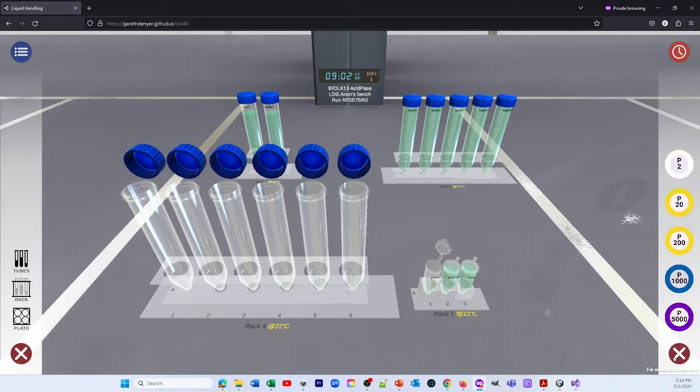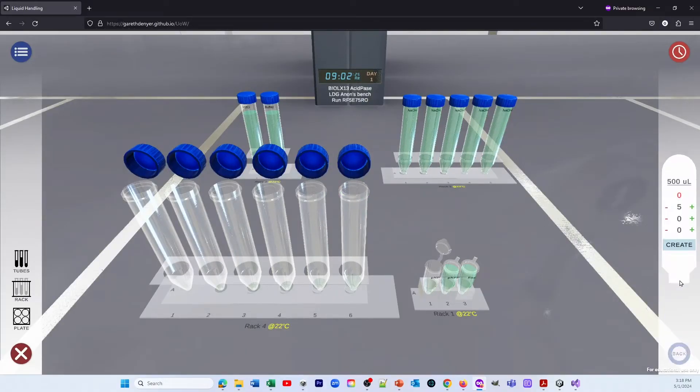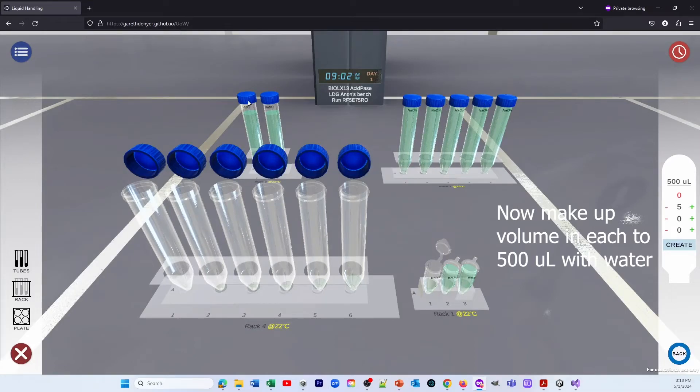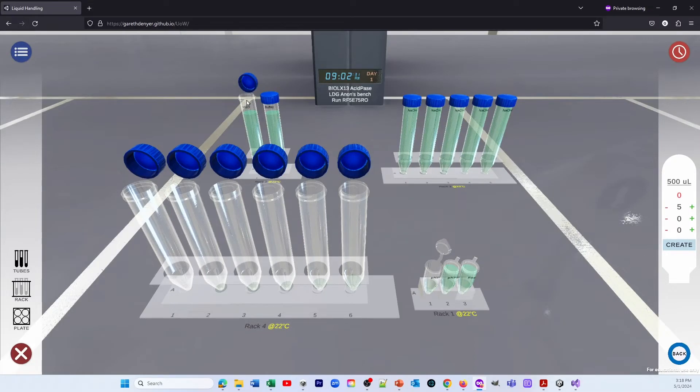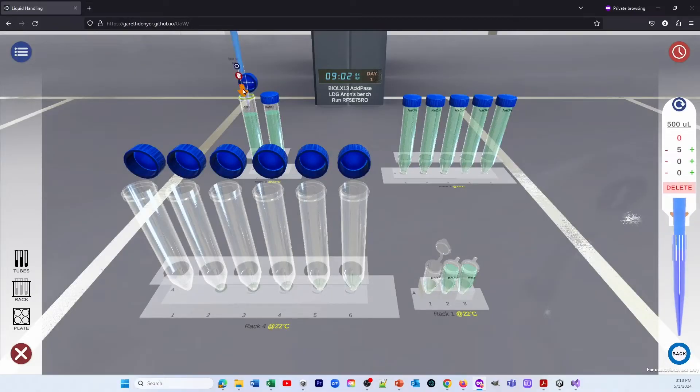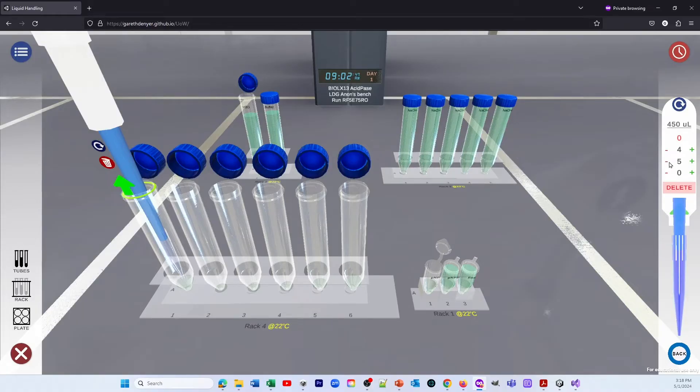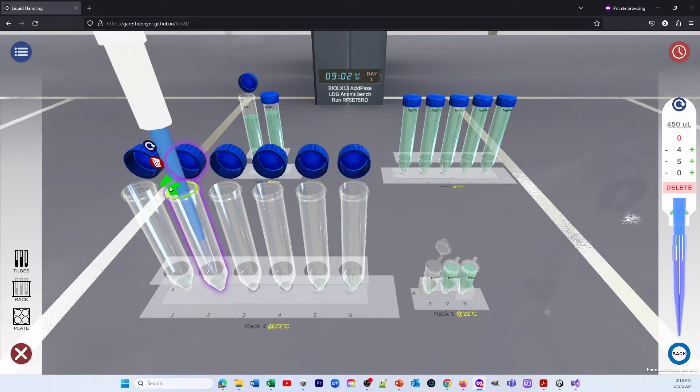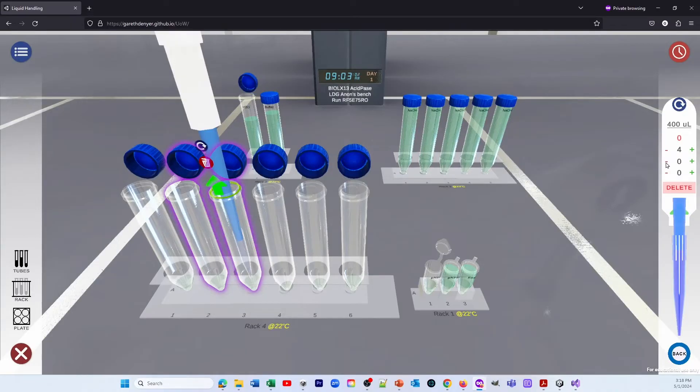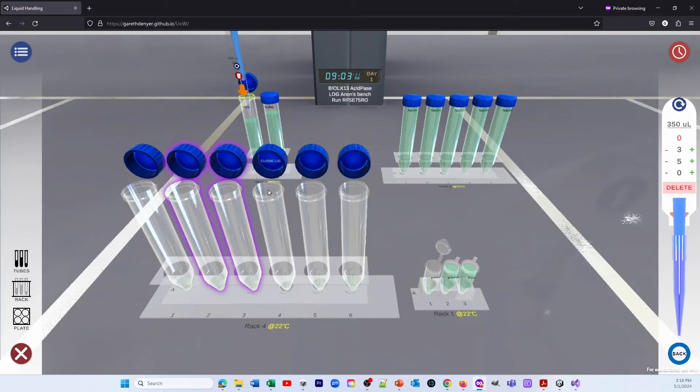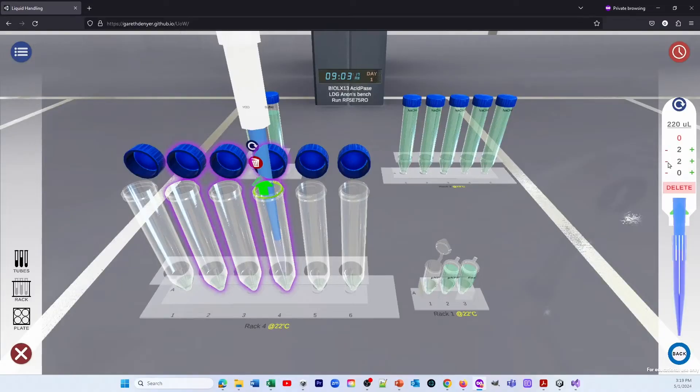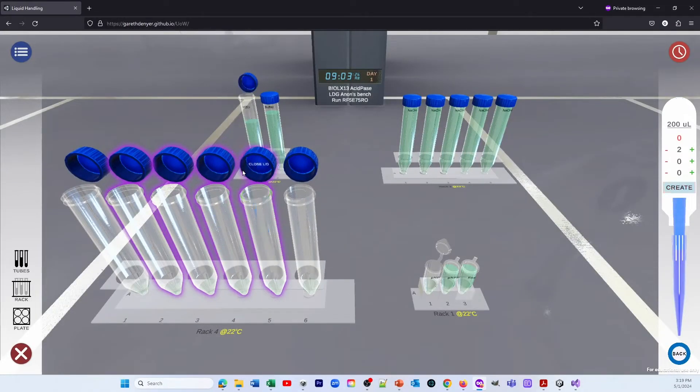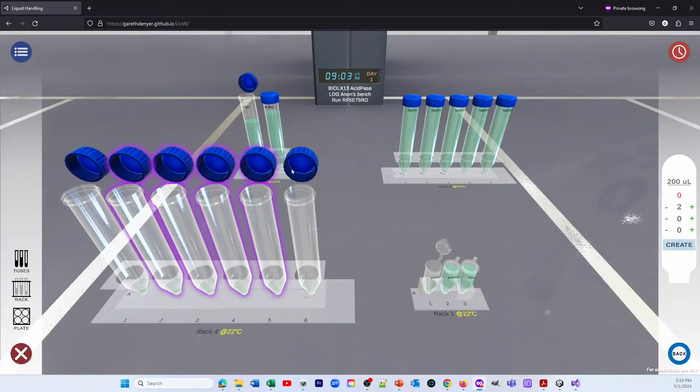Then what we're going to do is add water to the tubes to make the volumes up to 500 µL. So whatever amount of PNP we put in, we put the difference of water to make 500. So 500 into the first tube, 450 into the second tube, 400 into the next one, 350 into the next one, and so on. And then that will give each of these tubes 500 microliters.